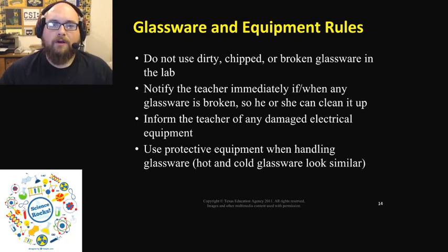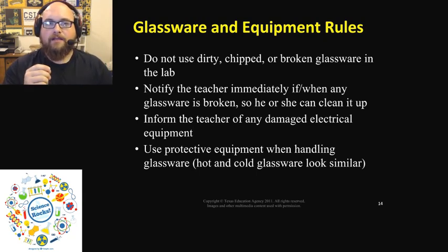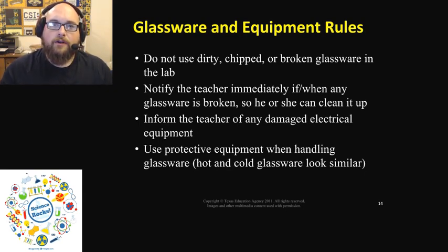All right. Also inform me of any damage you might see on any kind of electrical equipment. Okay, frays in the wires, cuts or holes in the wires. If there is a dirty surface that appears to have something on it that you can't identify, please, you must let the teacher know immediately. And also make sure you wear your proper protective gear when dealing with glassware.